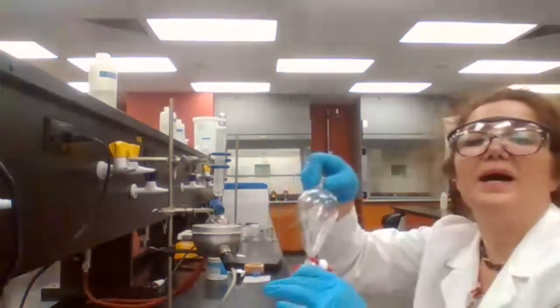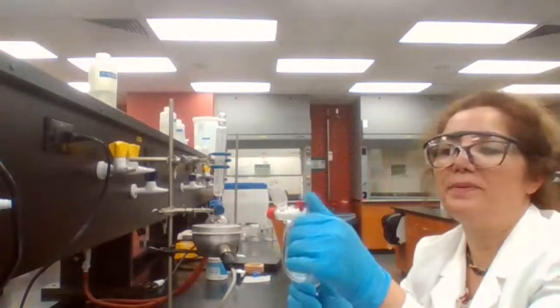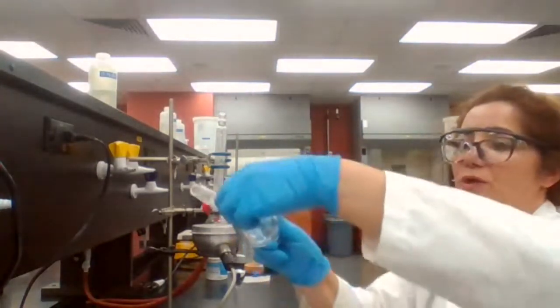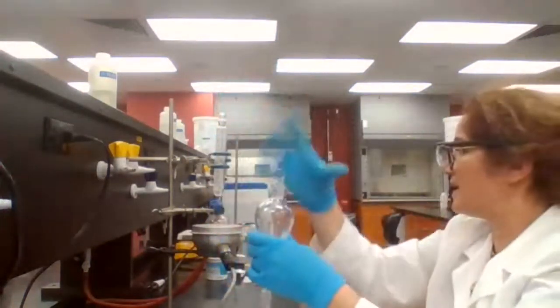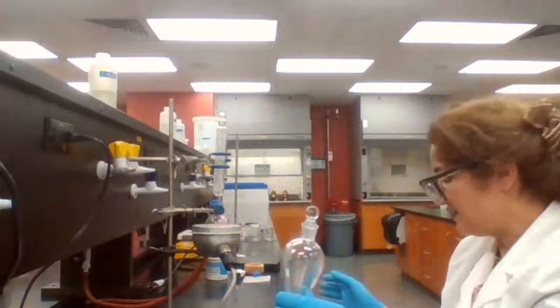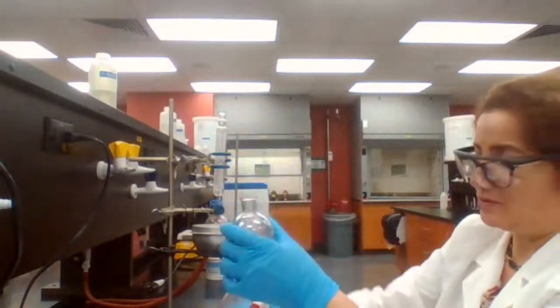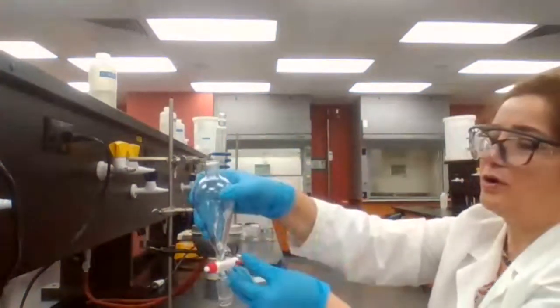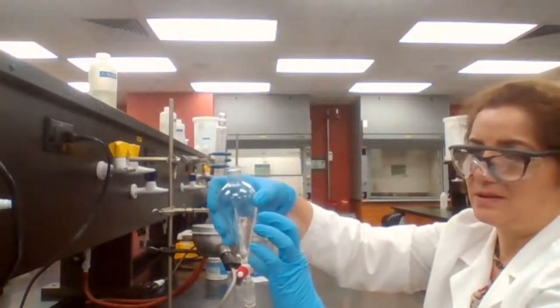Shake and what? Shake, vent. Venting means you open the stopcock to release the pressure. Then you close the stopcock, bring it to the right position. You place it inside the iron ring and let the layers separate until the two layers form. And take the cap off, open the stopcock to drain the lower layer.